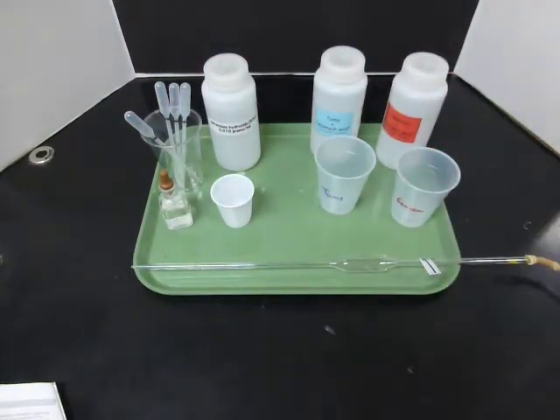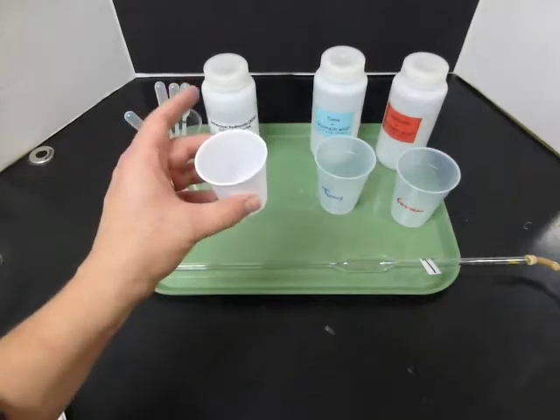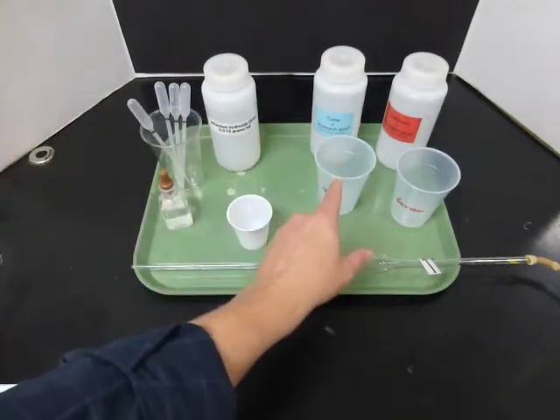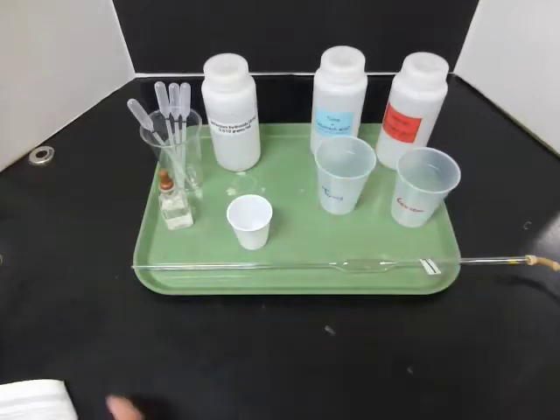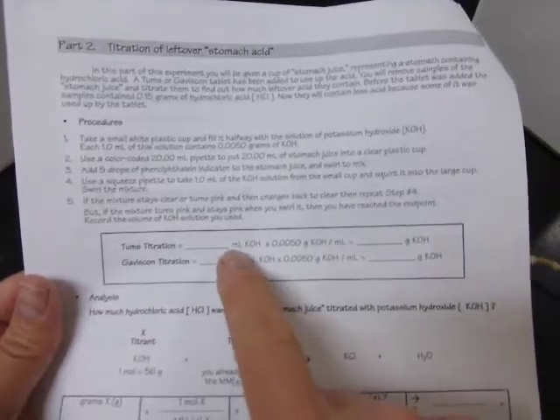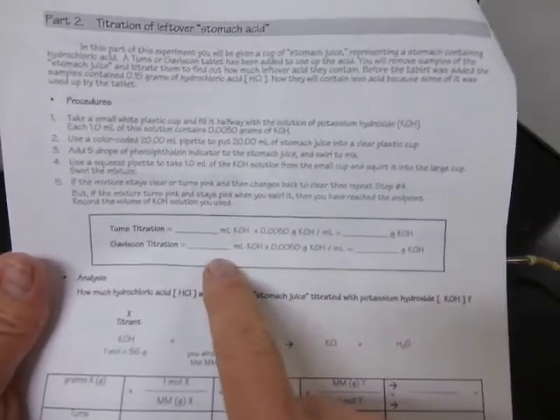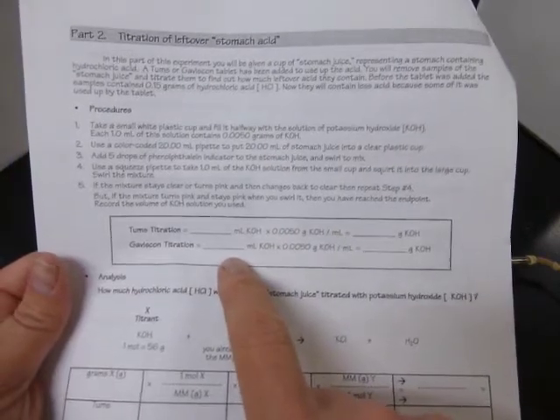So each person is going to need one small white cup and a little pipette, and a cup to sample for Tums and a cup to sample for Gaviscon. What we'll do is follow these procedures and take data for Tums titration and for Gaviscon titration. Each person can do their own data collection.